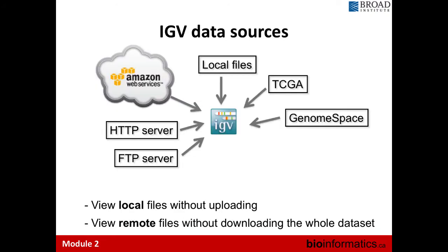IGV allows you to pull data from multiple different sources — locally, from TCGA, genome space, or servers. This enables collaboration across the world: as long as collaborators have access to your SharePoint, they can view any of the alignments or data files you currently have.